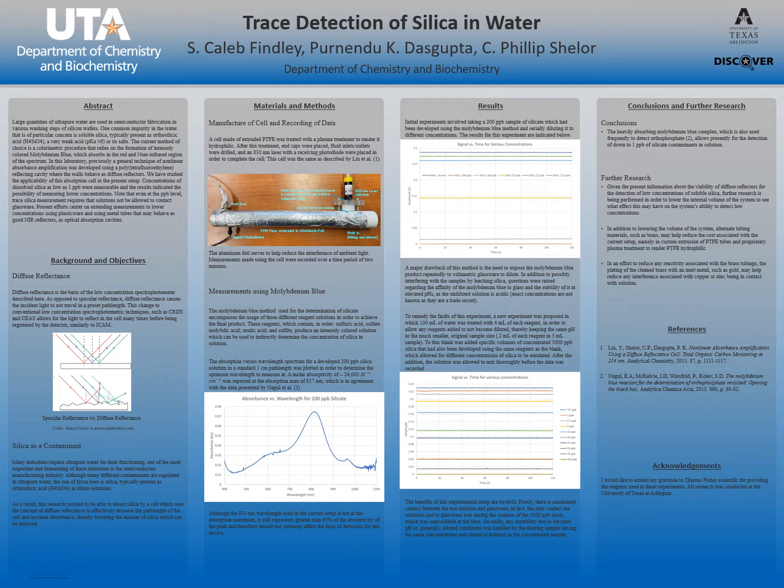Now, this specific test minimizes the problems and difficulties presented by the first test because we're diluting into a matrix which is the exact same as that which our solution is in, and contact with glassware was minimized to when we were originally creating the stock solution, which was unavoidable at that time.